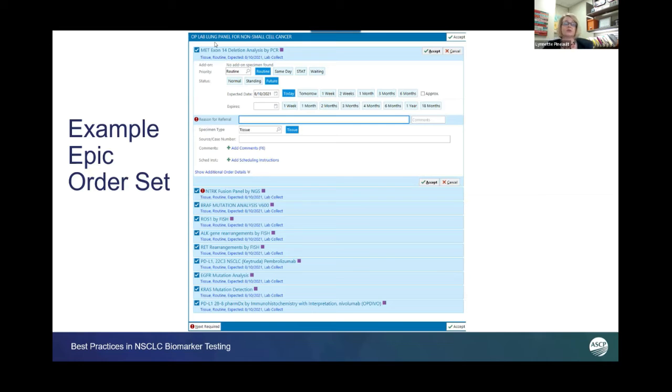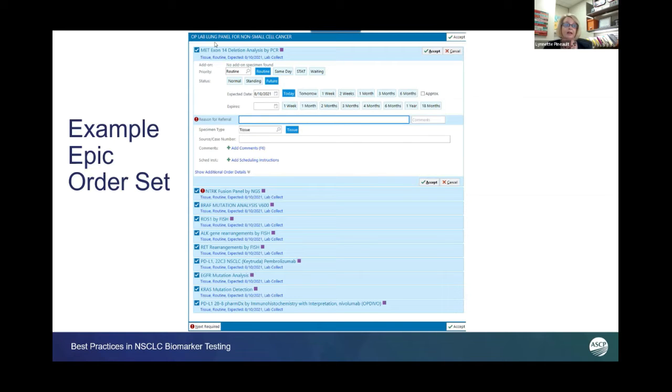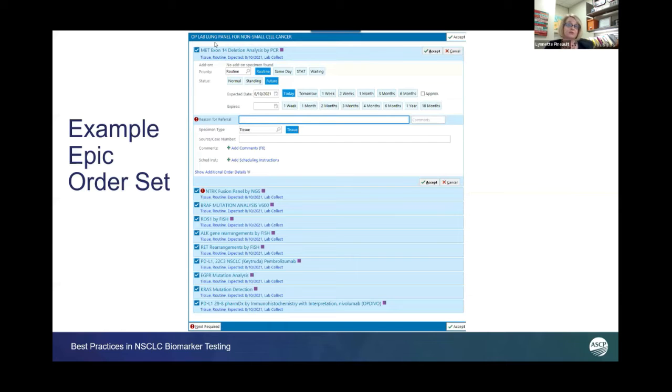What's interesting about this panel is we chose individual markers versus a next-gen sequencing panel. There were several reasons our organization decided to do that. One reason is we don't do in-house testing. Ours is all reflex testing.